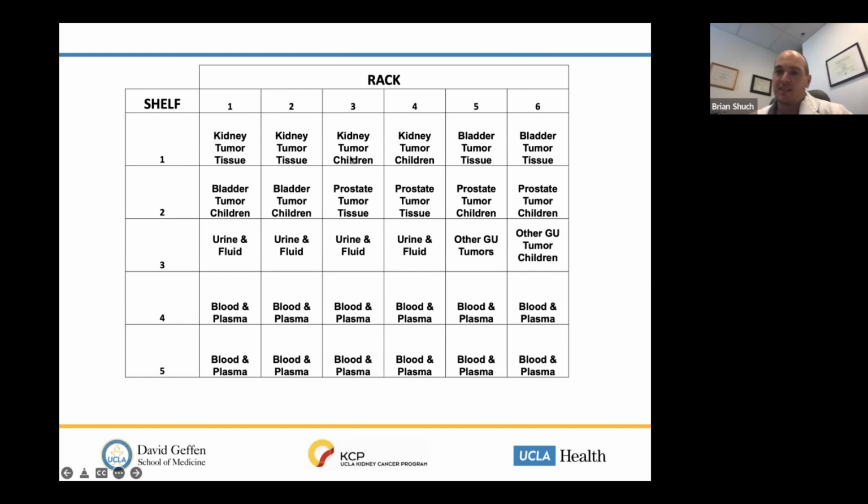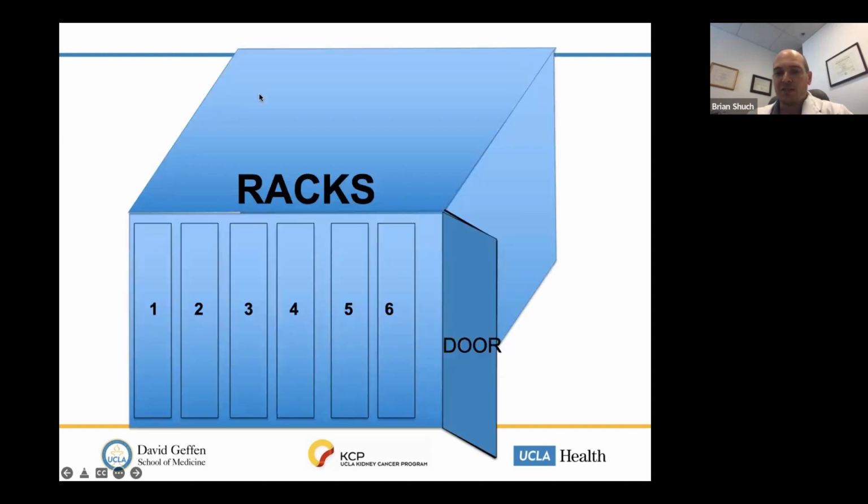The children, basically anything you would do to the specimen, the DNA, the RNA, maybe you're looking at metabolites, so it can all link and there's a home for it. And it's useful to have them together. So when you're pulling it out, you don't have to look in different places, you pull out the same shelf rack box.